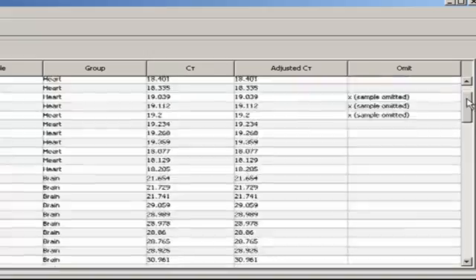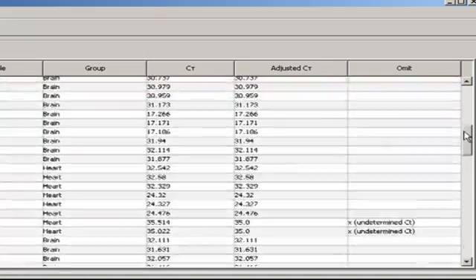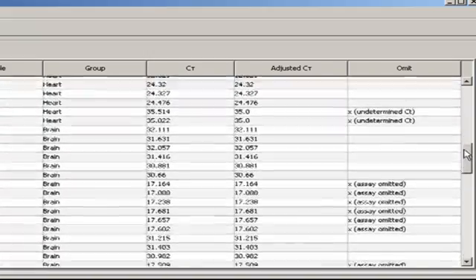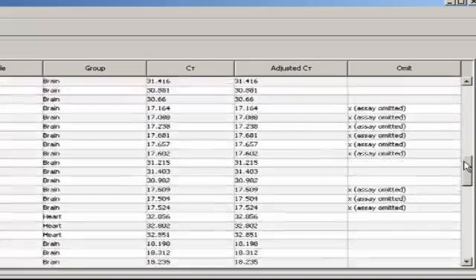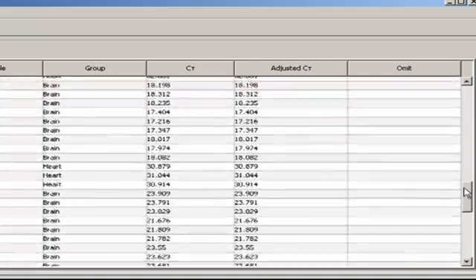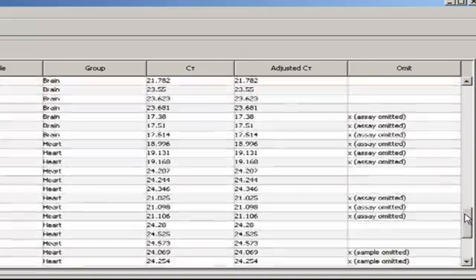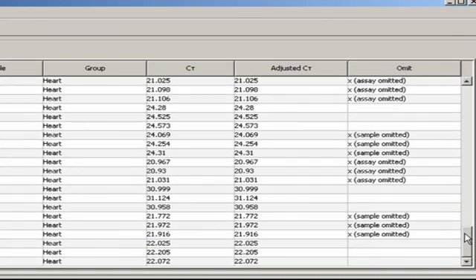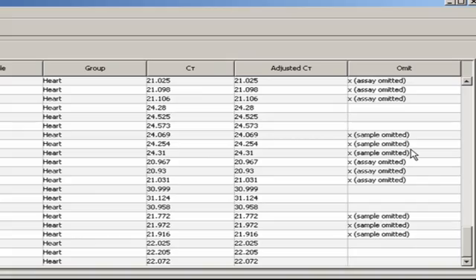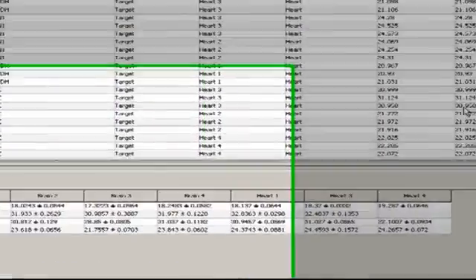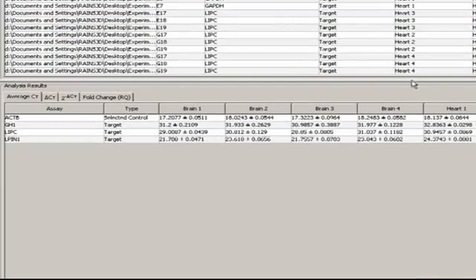It appears that we have a few individual wells that were omitted, and you can also see where we manually omitted GAPDH. In the lower section, the various delta-delta CT calculations are broken down.